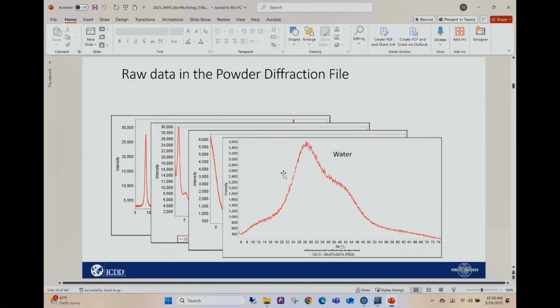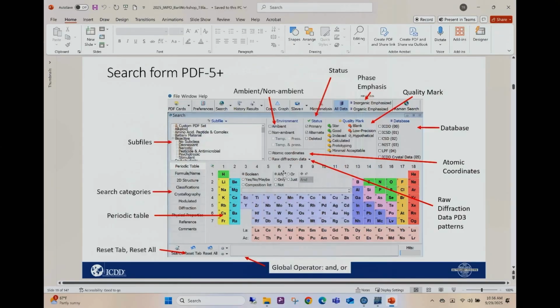And I will say, it wasn't simple to put the pattern in there because you're collecting your data, and what does water want to do? It wants to evaporate. So you've got to be collecting the data at a speed that you can get a good pattern, but yet enough good data, all right?